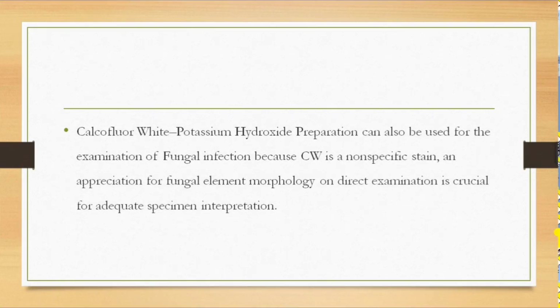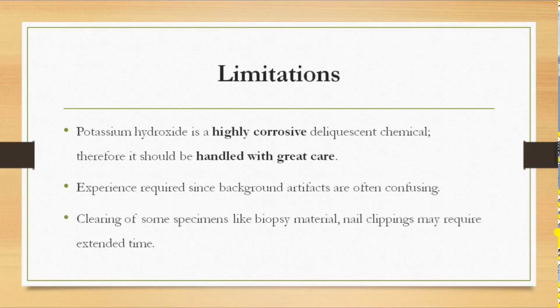An appreciation for fungal element morphology on direct examination is crucial for adequate specimen interpretation, because mainly we will be getting clinical specimens for KOH examination and the disease treatment will depend upon the interpretation of the microbiologist.